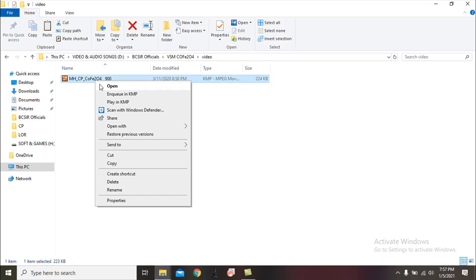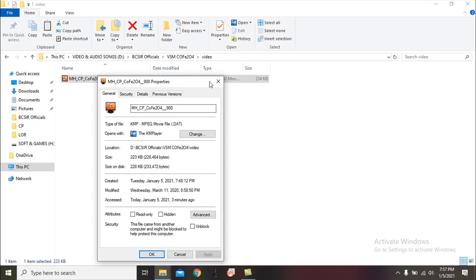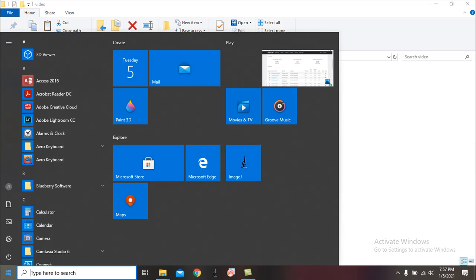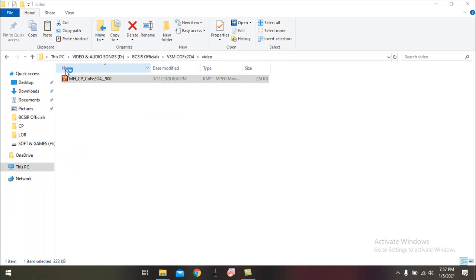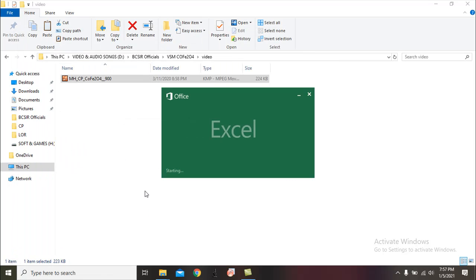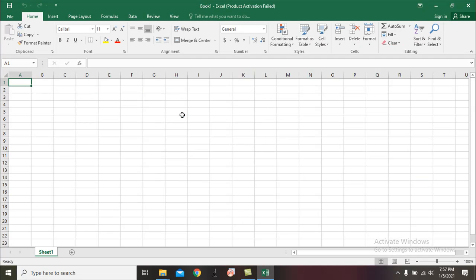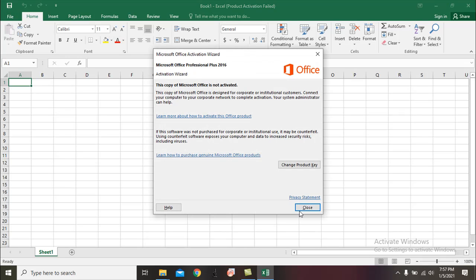VSM data are usually given in a .dat file, so at first we have to convert the .dat file into an Excel file. In this case we have to open Microsoft Excel and open that .dat file through Microsoft Excel in this way.